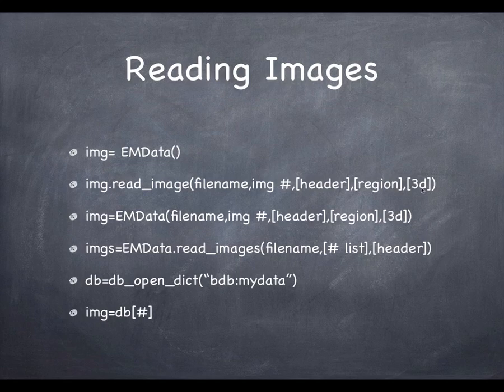And 3D isn't something you normally have to specify. That'll give it a hint. There are certain file formats where they store 3D volumes and stacks of 2D images in the same way. And this allows you to tell it that it's a 3D volume, not a stack of 2D images. We're going to skip this stuff down here. It doesn't really apply today. So let's give that a try.